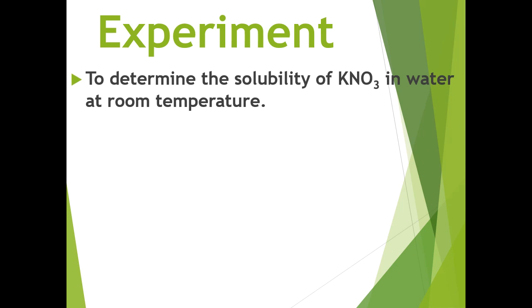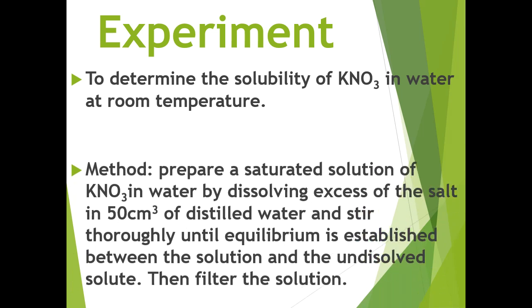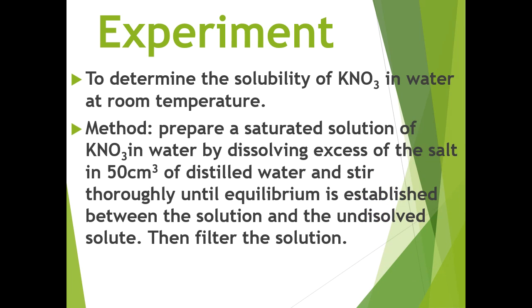Now, to determine the solubility of any salt, let's say potassium trioxynitrate 5 in water at room temperature, the method involved in this experiment is as follows.